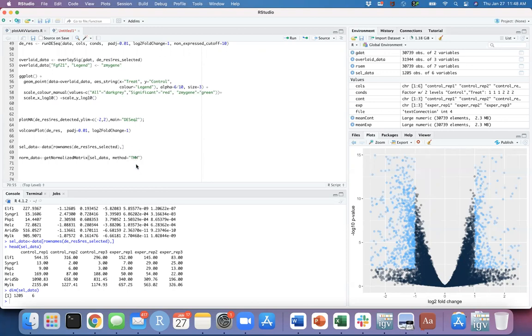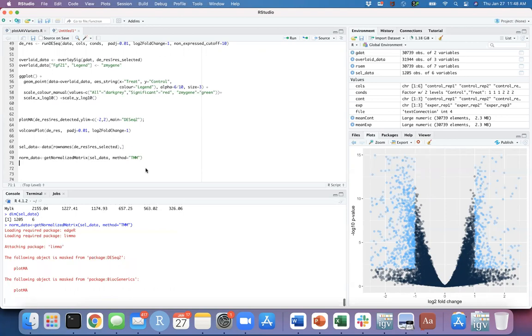These are still normalized, but TMM is not adjusting everything to 1,000,000. It is still adjusting the medians. When I'm showing the browser, I will show what TMM is doing, before normalization and after normalization. But here, basically, I'm just going to normalize using TMM. There are other methods here that you can look at.